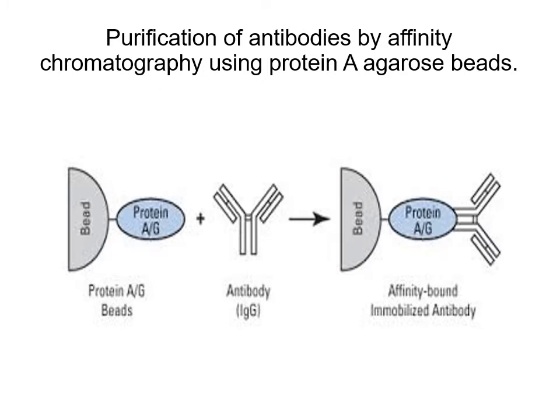This slide represents what's happening when you're binding protein A or G agarose, attached to a bead, to antibodies in solution. The antibody, when it's encountered by the protein A or G agarose, binds to it by the stem region and is retained by the column after extensive washing to remove other proteins. The binding is very firm, but the immunoglobulin can be released by changing the conditions such that it can then later be eluted from the column, releasing itself from the protein A or G.